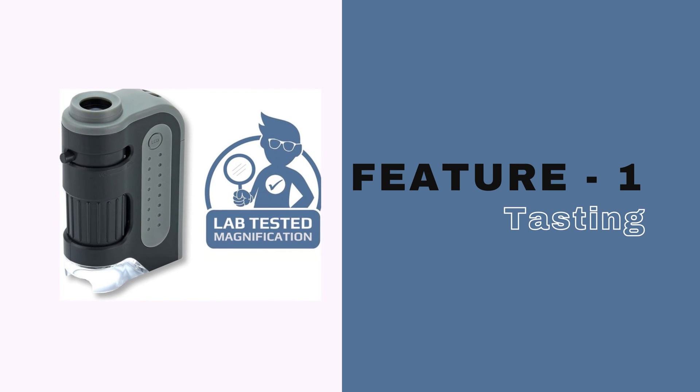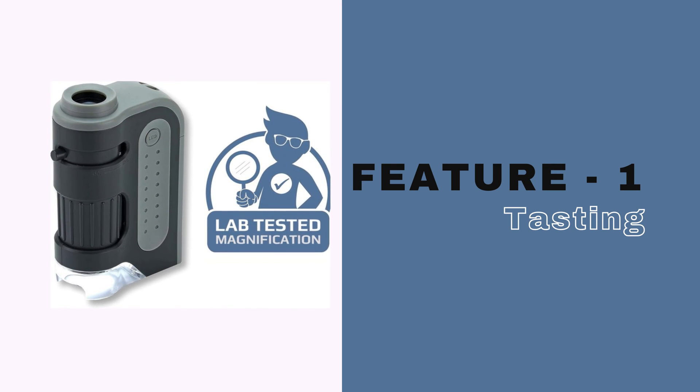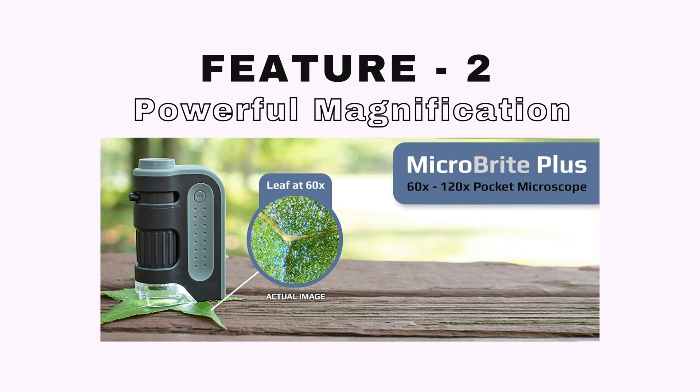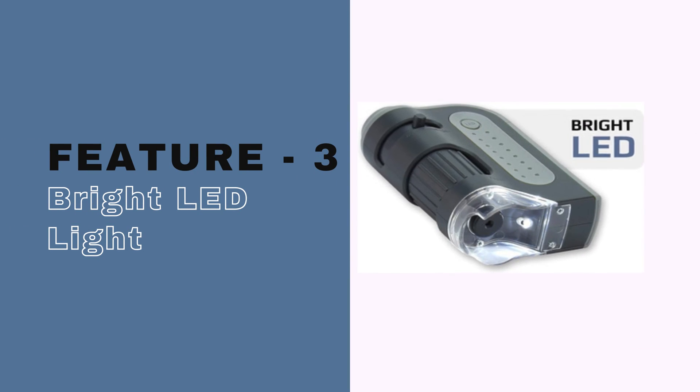Each and every one of these products is personally tested by engineers for 100% magnification accuracy. It's a pocket microscope with a powerful 60x to 120x magnification rate. The bright LED light is powered by a double-A battery.